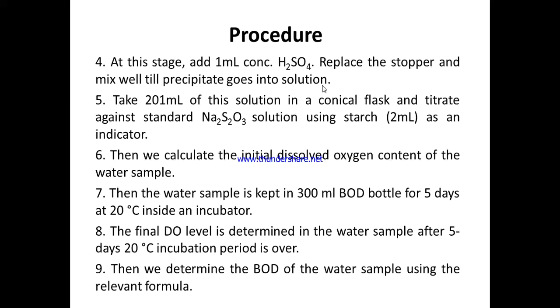Then after titration, when it has been titrated against standard sodium thiosulfate solution of 0.025 normality, the end point will be basically colorless. वो blue color से या फिर bluish green color से the water sample in the flask will turn colorless. जैसे colorless हो गया, we will note down the final volume. We will note down the initial volume of sodium thiosulfate. Then as soon as the water sample in the conical flask turns colorless, we will note down the final volume. So what is the volume of sodium thiosulfate that is consumed? Final volume minus initial volume is the volume of sodium thiosulfate that is consumed.